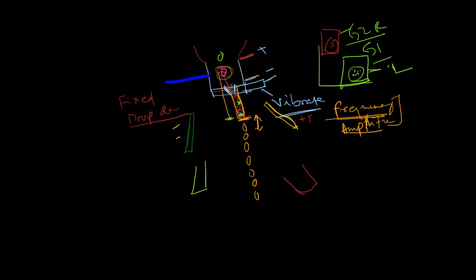We want to sort the green cell. Consider the green cell at the edge of the stream. In the next step, this cell breaks off from the stream and goes into the droplet. On a flow cytometer, we never sort cells per se, we sort droplets that contain the cell of our choice. As the drop breakup happens, the droplet carries the cell.